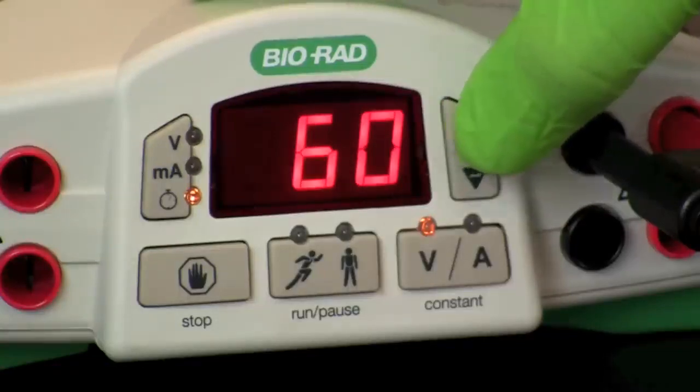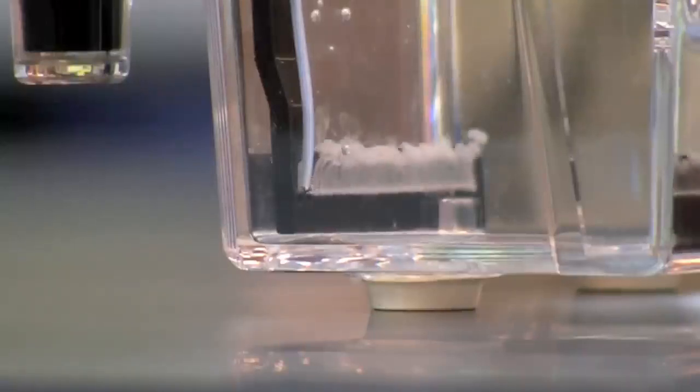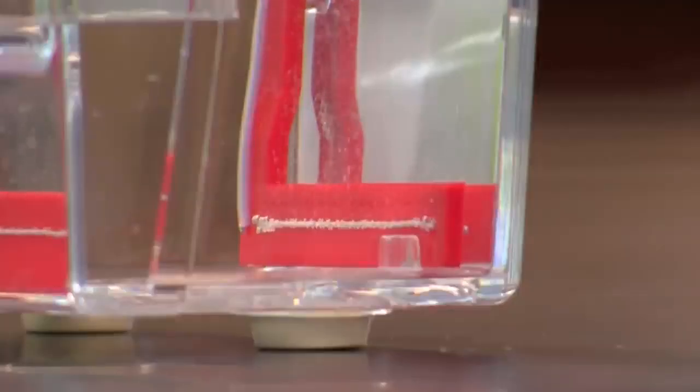Press the start button to begin the flow of current that will separate the DNA fragments. At this point, you should be able to see bubbles coming from the wires at each end of the gel box. Notice that the positive or red electrode has fewer bubbles than the negative or black electrode.